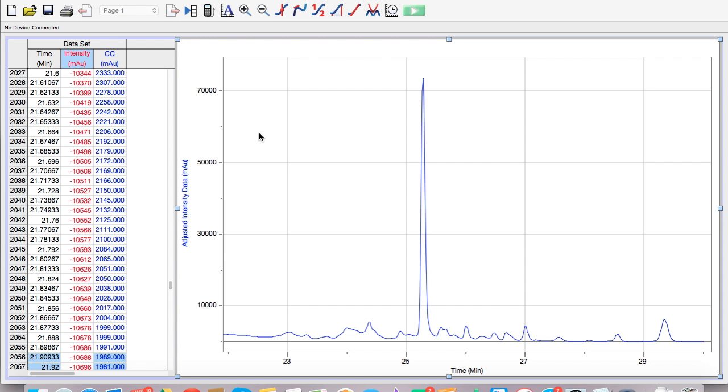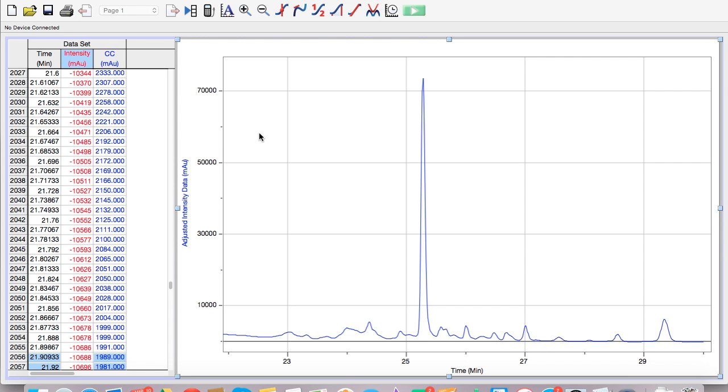Now we've got our data adjusted in Logger Pro. Now we want to go and integrate it so we can actually see how big each peak is with respect to the whole amount. This is HPLC data. Each peak represents a compound that's coming off of our column. The size of the peak represents the relative amount of that compound in our mixture. So we want to go through and find the relative size of each peak with respect to all of the compounds that came through the column.